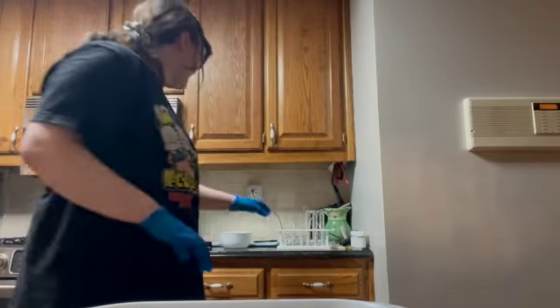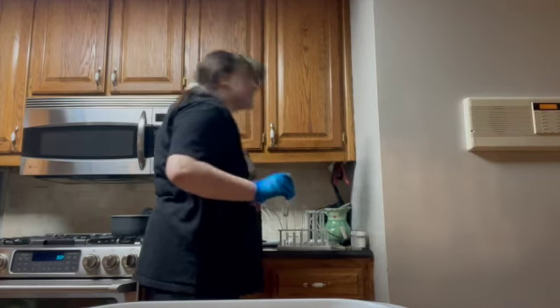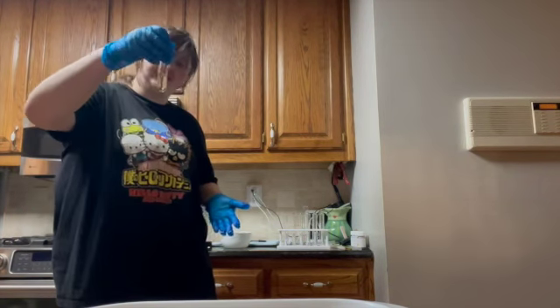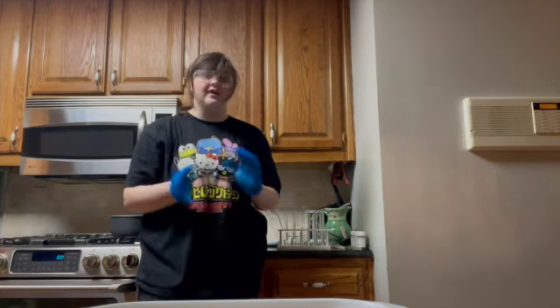Okay, so our final time that our reaction 2 has gotten clear was at 35 minutes and 11 seconds, so around a minute to 2 minutes faster, so it's not by too much. And our final temperature is the same as our beginning temperature at 25 degrees Celsius.